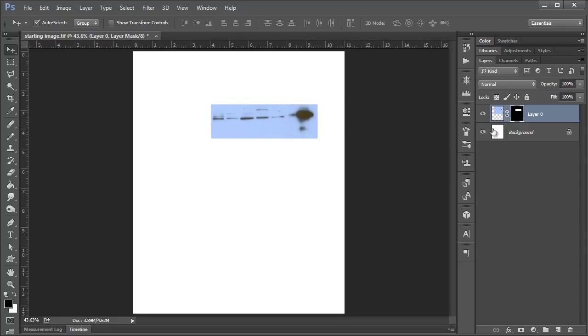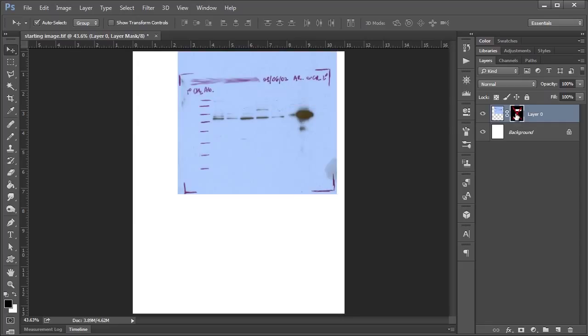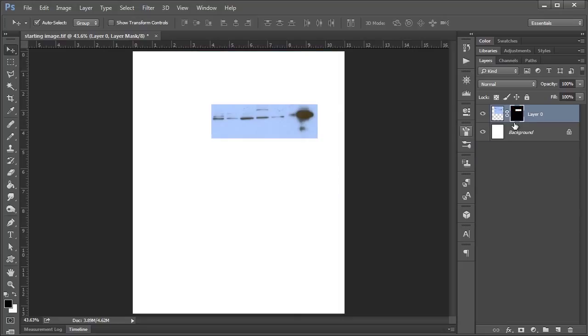If at any point you need to go back and, like me, you need to see where your ladder was and what your other information was, if you go to your Layers panel here and hold the Shift key and click your layer mask, that's going to bring this red X over top and reveal everything again. So it's just going to disable your layer mask. You can go and look and see what you need, and then if you hold Shift and click again, it disappears.